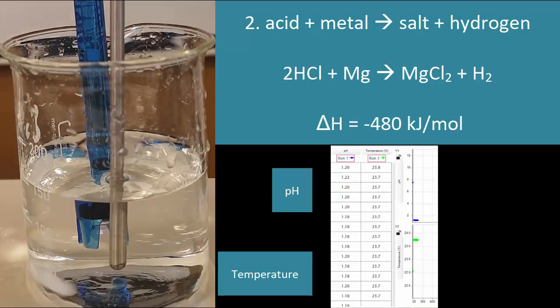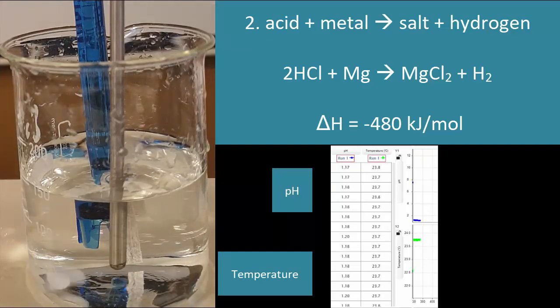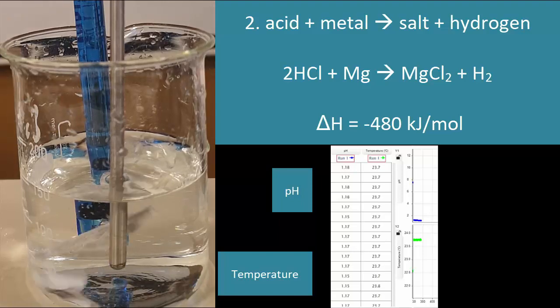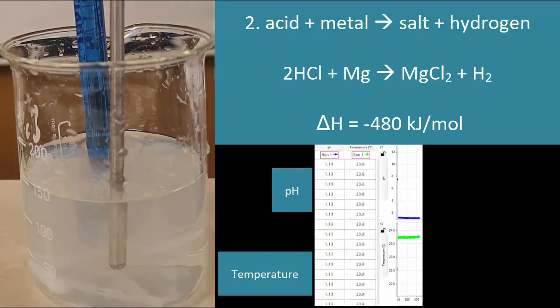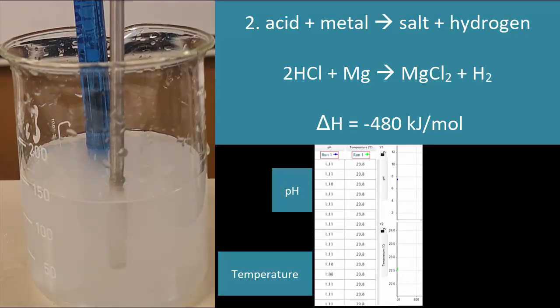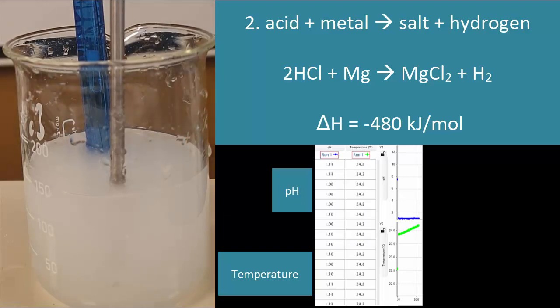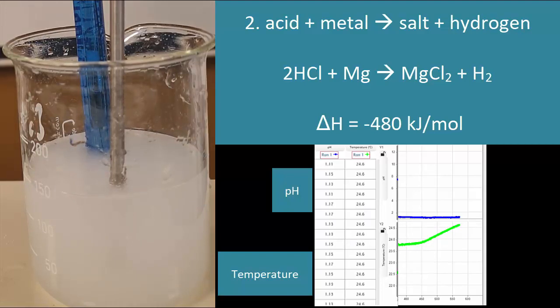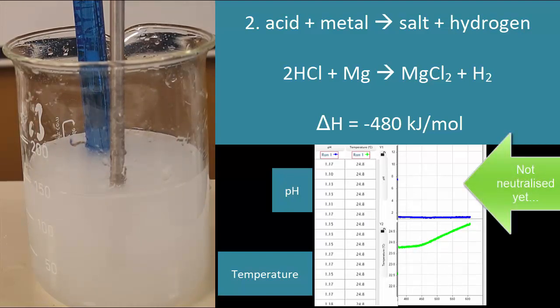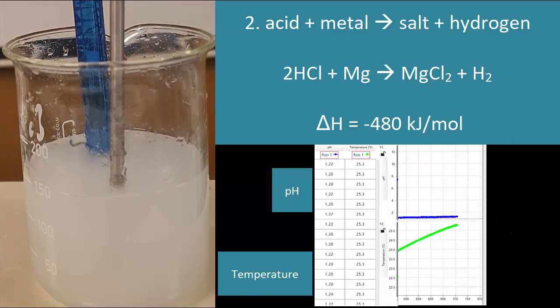And so this one here is the magnesium. Now this one takes forever to react. As you can see, it has a huge enthalpy, but the temperature is not going up. I fast-forwarded this at 10 times speed and it's still not getting there. It'll end up giving steam. You'll see when we do the pop test, it really gets super hot. The neutralization is very, very slow. It's only creeping up. So we'll skip that one and go to the last one.